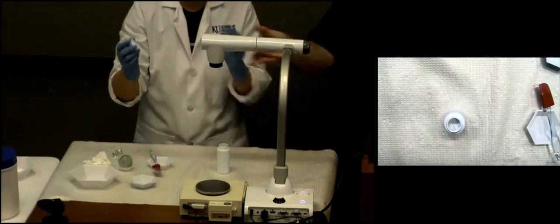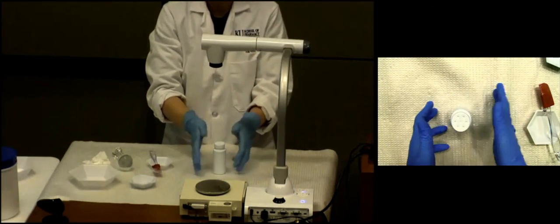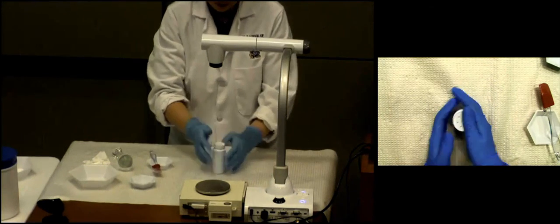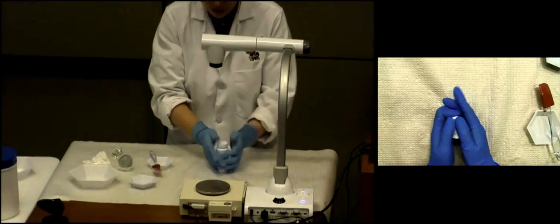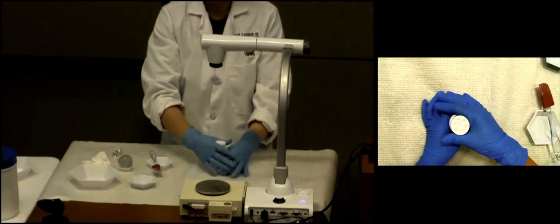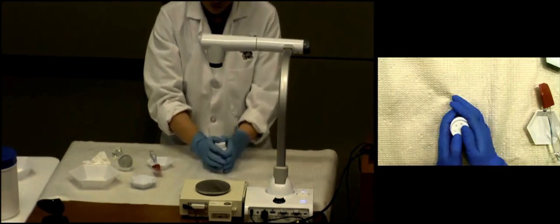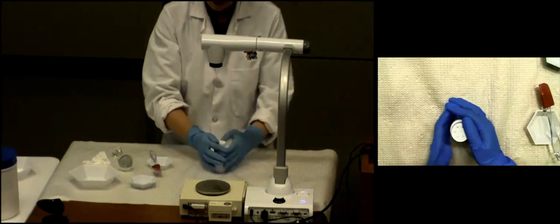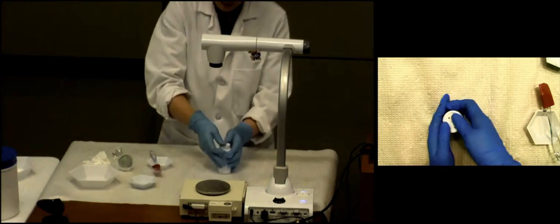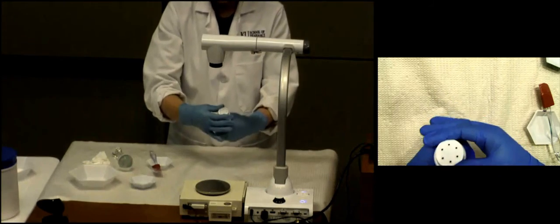You cannot just give the bottle to the patient. You have to close it with a lid, and this lid you have to press down with your thumbs. You should hear a click. Okay, so now you can turn, oh, actually, but it's not quite there yet. It does take some force and kind of a snapping thing. You can use your palms, but I will warn some of you Hercules out there. Some people just mash it down really hard. You will crush the neck of the bottle. So we want to snap the lid on there, but don't push it down so hard that you crush the neck of the bottle, please.